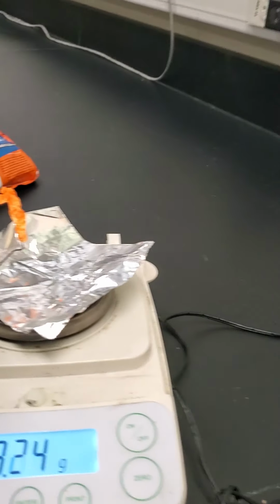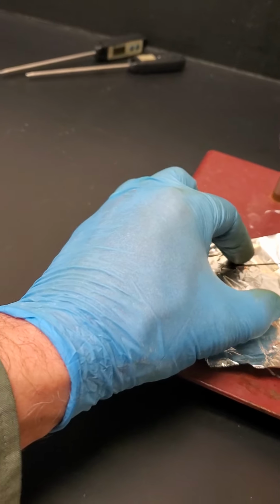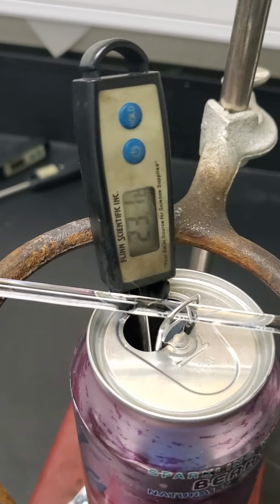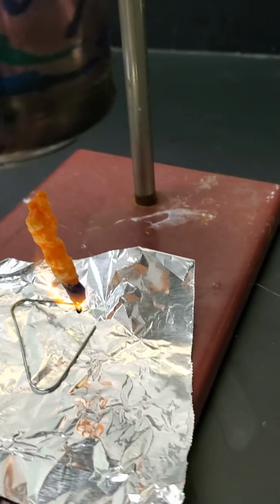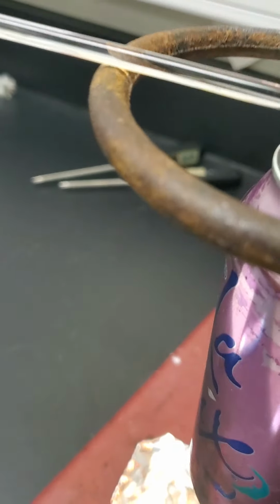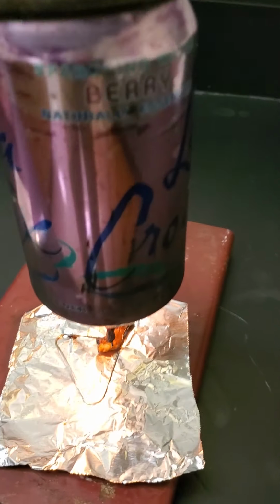And just to be sure, that was the mass of the Cheeto Crisp. So, okay, here's the initial temperature for the third one. Okay, now we're burning the Cheeto Crisp. Oh, that kind of fell.